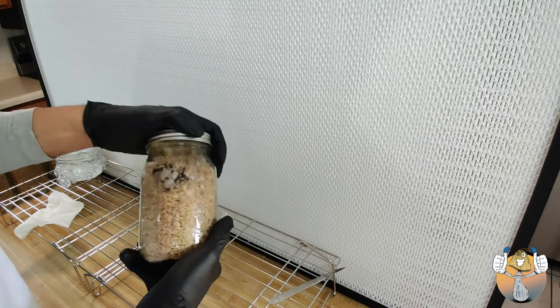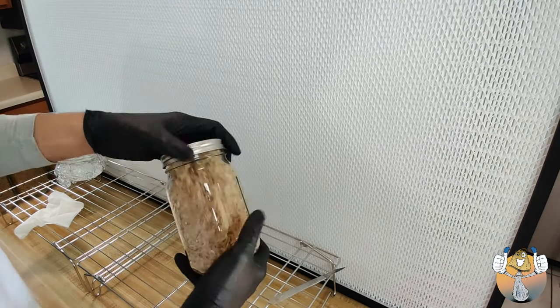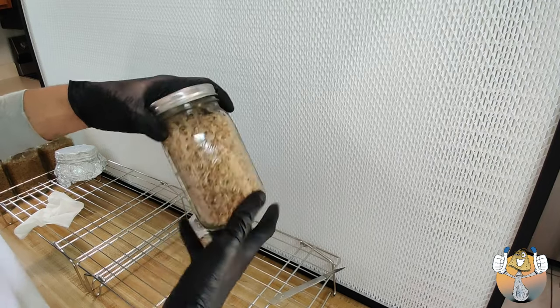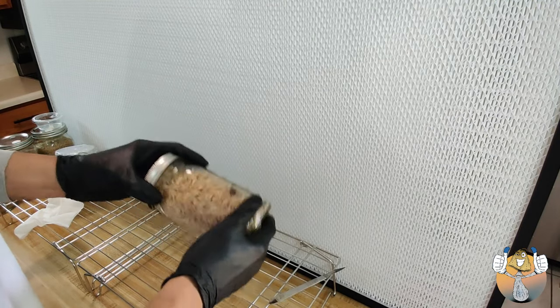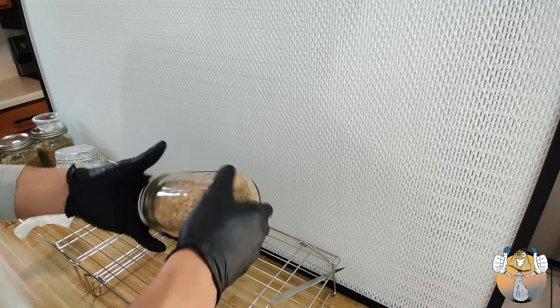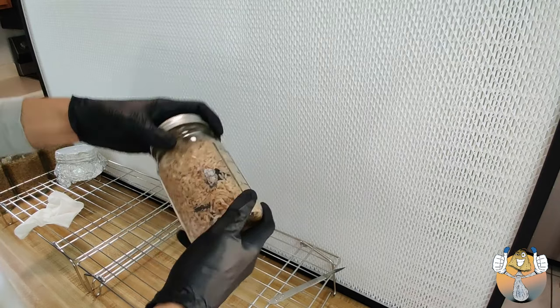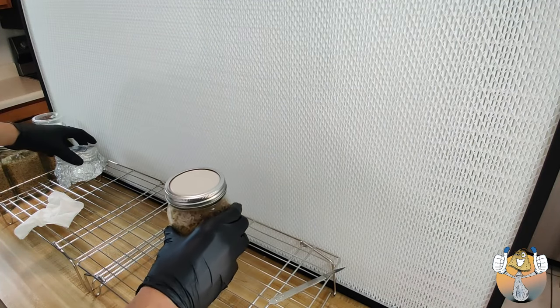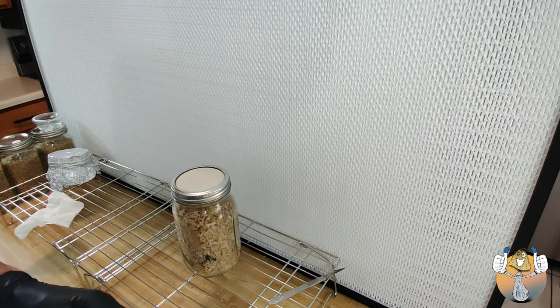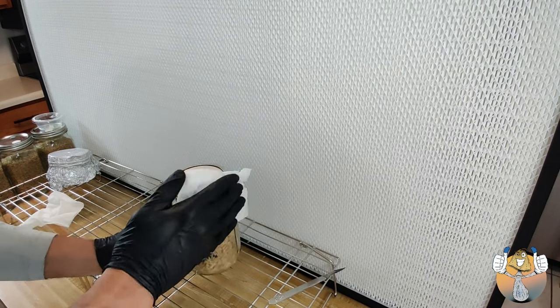Give this the last shake. And we'll set these babies in the incubation box and check on it in a few days and see what we have. Hopefully the rice is good, which I think it would be. We took the necessary steps. We did our thing. We should be good. No worries, man.